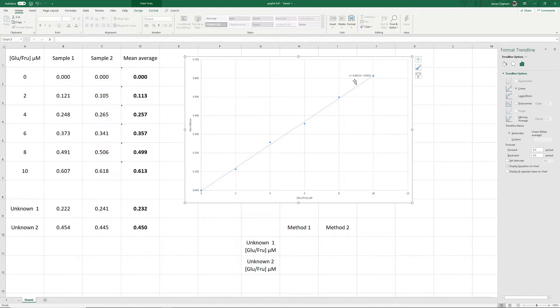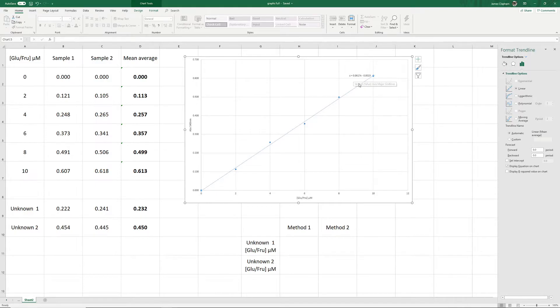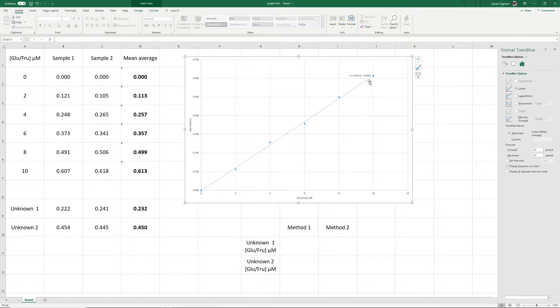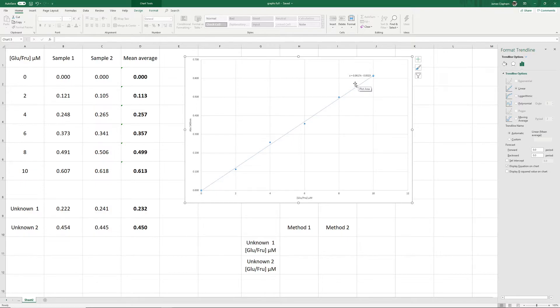What this equation says is that a y-value is equal to 0.0617 times x minus 0.0023. So what that means is, if we know the x-value, all we need to do is times it by 0.0617, then minus 0.0023, and that will give us the y-value. The problem is, we have our y-values, but we do not have our x-values, so this equation as it is is no good to us.